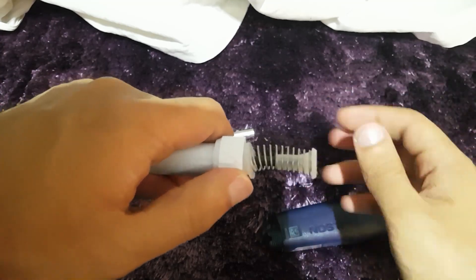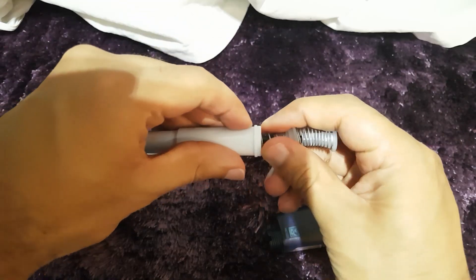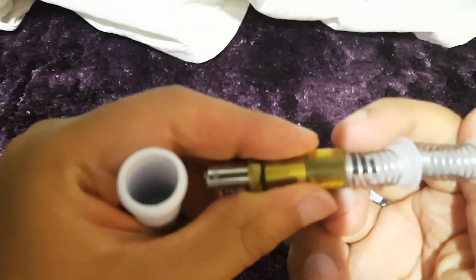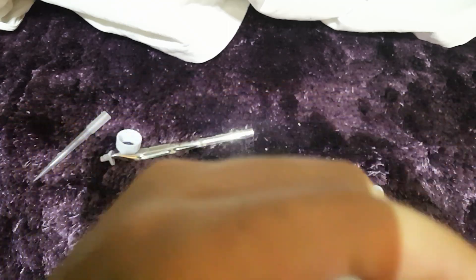As you can see, we come to the main part of the pipette in here. It simply just pops out, and this is the air chamber inside.